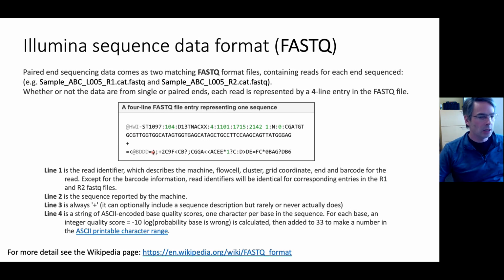The main thing to know is that Illumina transitioned, maybe 10 years ago now, from version 1 to version 2, and you see the quality score notation changed. There are some telltale signs where some characters are used and others are not in one version versus the other.